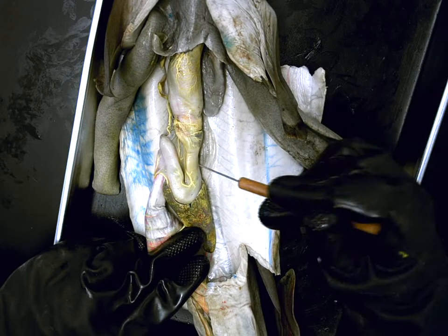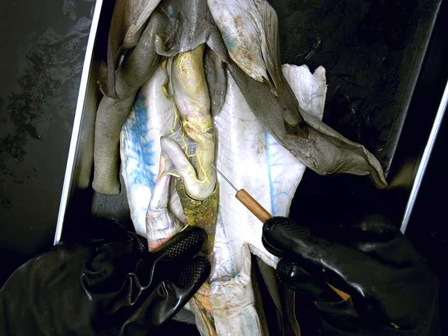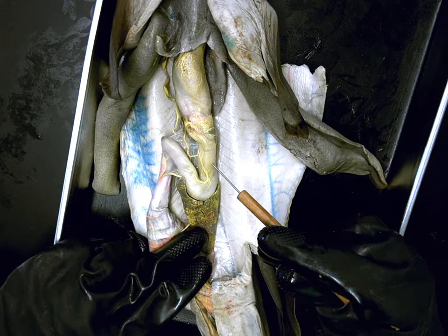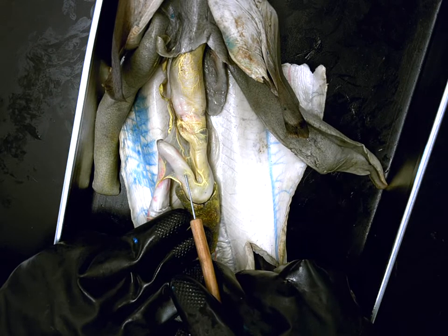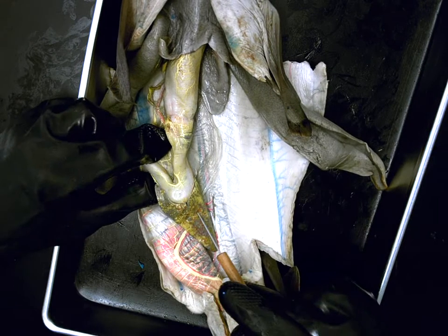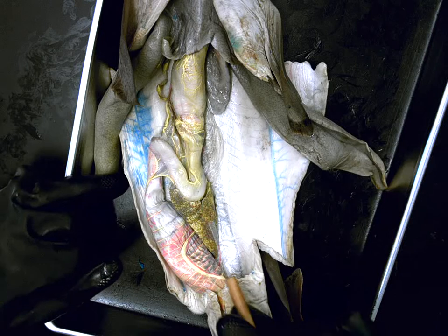This lovely, nice J. The first portion of this J, Carla, has a very specific name. Cardiac. Cardiac stomach. Function. Excellent. Second part has a name. Function. Chemical digestion. Excellent. At the base of the J-shaped stomach is this kind of V-shaped dark organ.